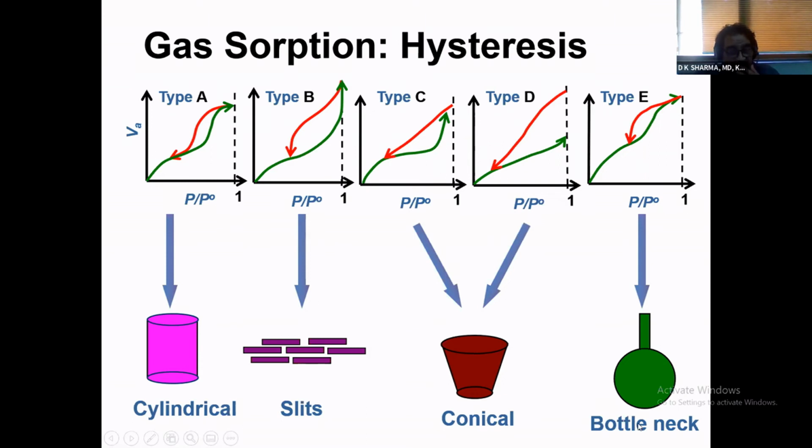And another discussion that I want to do is about the bottleneck, as to why bottlenecks result in this sort of hysteresis. Let us consider adsorption and desorption from this shape of the pore. Okay.